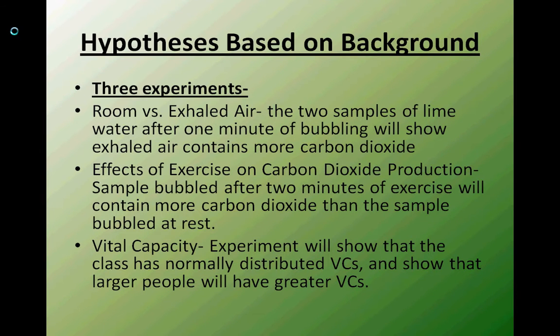The hypotheses that we formulated for these three experiments are now listed. For the first experiment, where 2 samples of lime water were prepared, we predicted that after 1 minute of bubbling, the lime water bubbled by exhaled air will contain more carbon dioxide than the sample that was bubbled by room air.